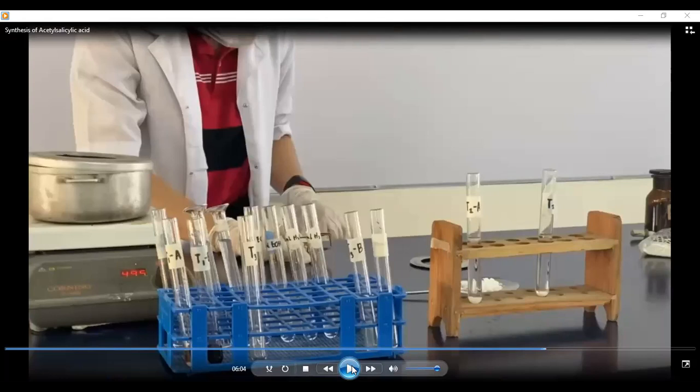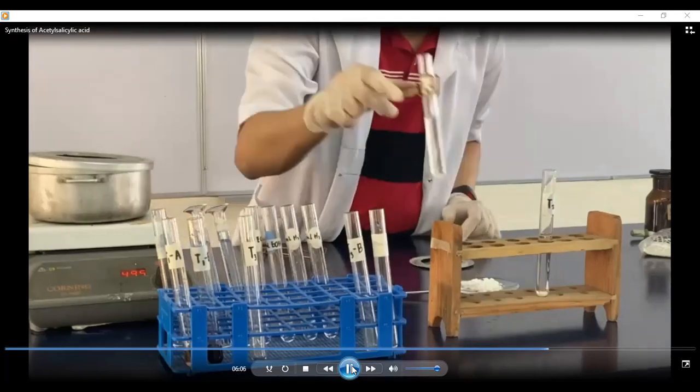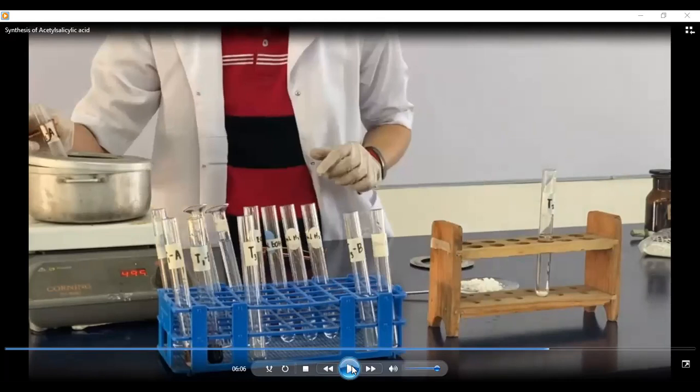Now, if you notice, our table was a bit cluttered at that time because we were already in a hurry. For chemical test number 2, since it is connected with number 3, we had to prepare all of the chemicals at once so that the flow of the experiment would be faster. Chemical test number 2 is also a bit harder because heating is involved, unlike the previous test, which had no heating involved.